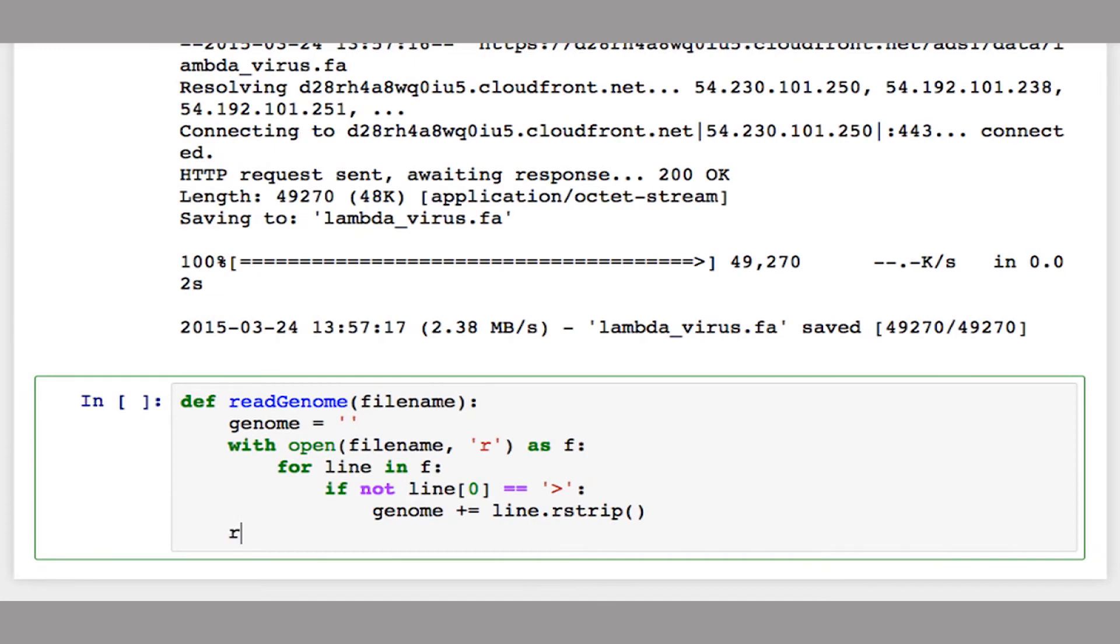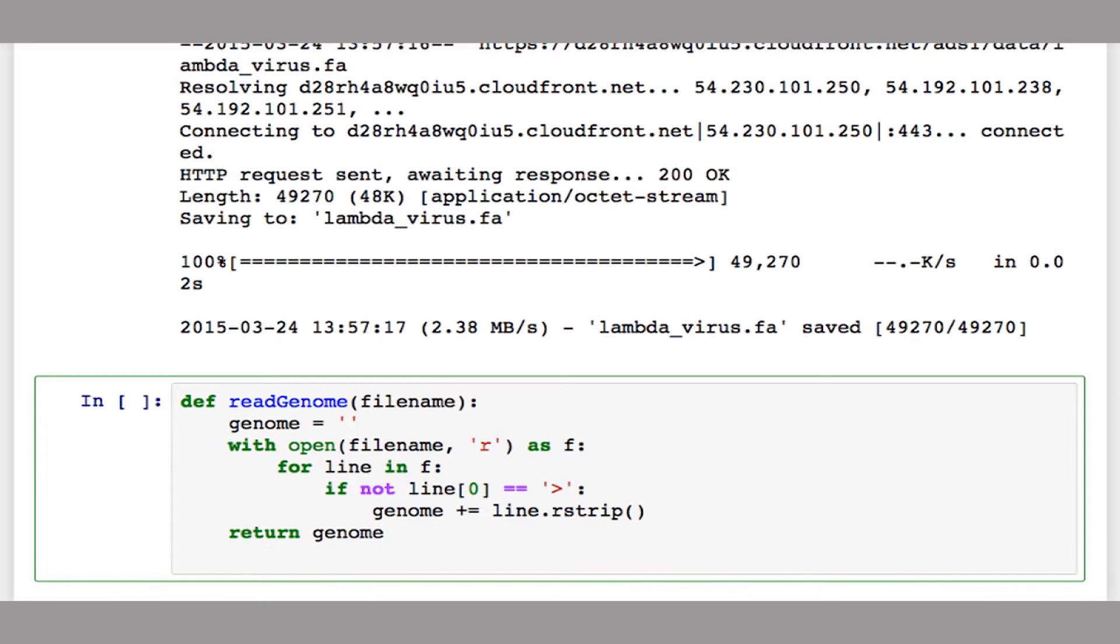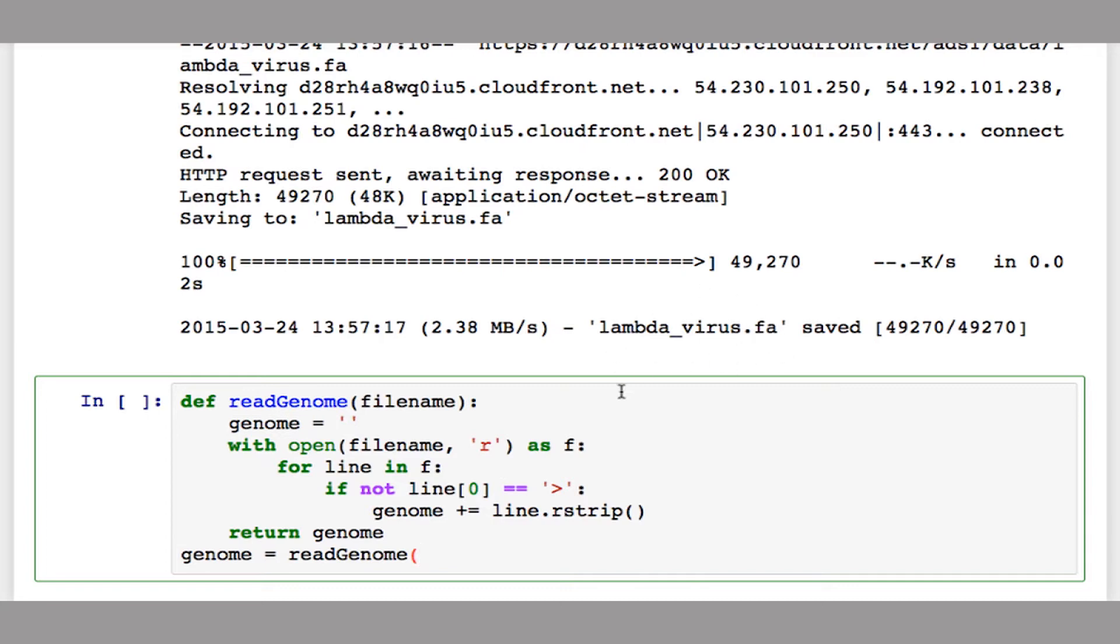And then when all this is done, I'm just going to return genome. So let's run this. Let's read the genome. So I'm going to say genome equals read_genome. I'm going to pass in the file, the name of this file, which if you use wget, is written right there. So lambda_virus.fa.